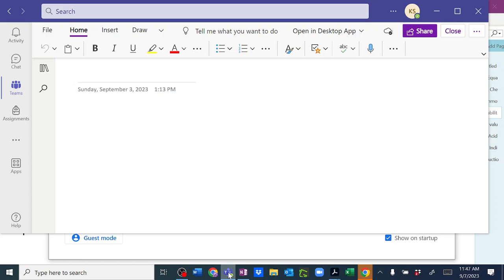What you want is, if I'm looking at green, let's say that this is a green solution, then that's red. It's going to absorb red the best because green is really good at absorbing red. And this wavelength will correspond to red. It does absorb all the other wavelengths as well, but it absorbs red the best. So you don't want it to pass through.